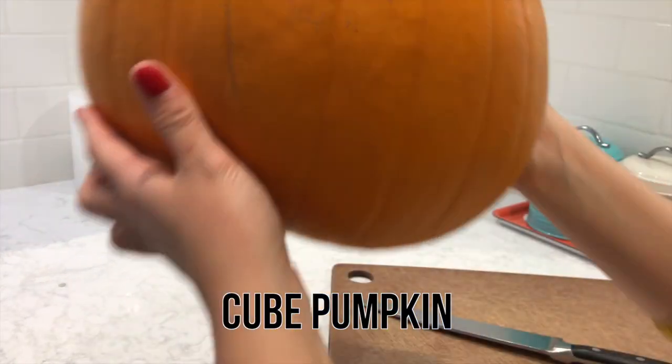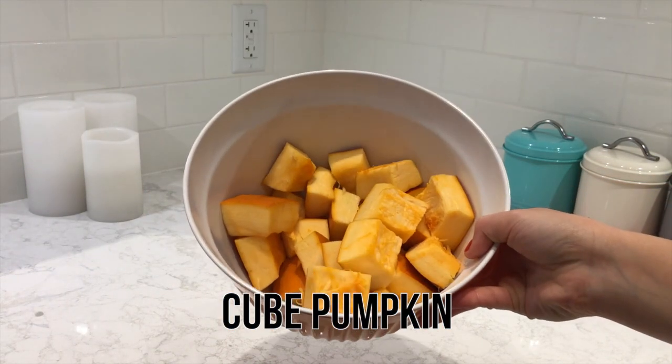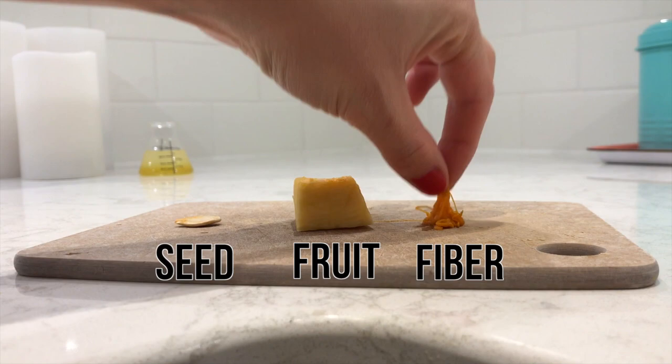Start by cutting the pumpkin into cubes. Make sure you get an adult to do this step. I selected three different parts of the pumpkin to look at under the microscope: the seed, the pumpkin itself, as well as some of the fiber inside the pumpkin.